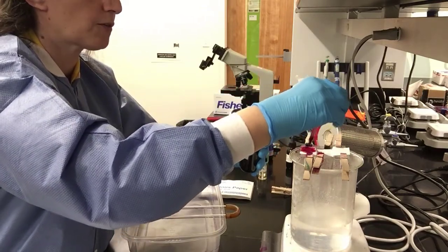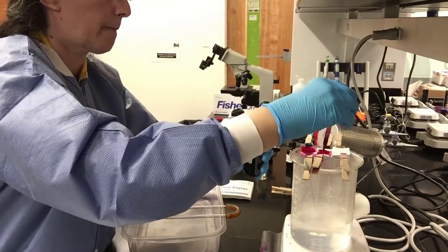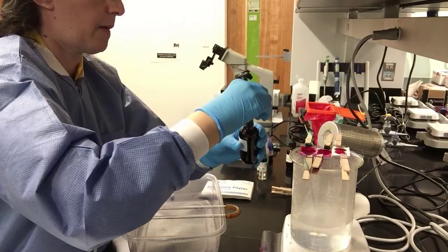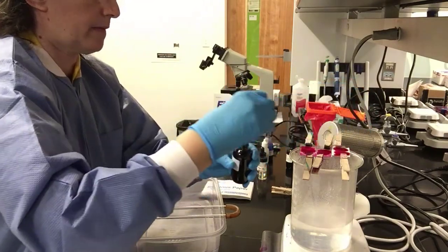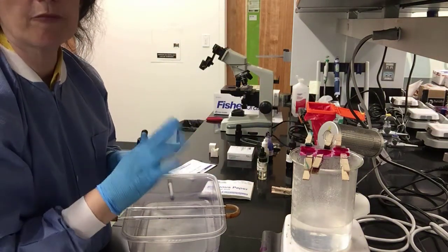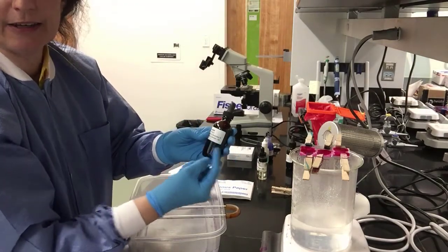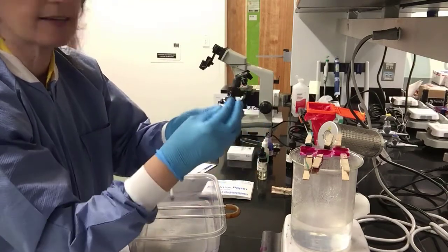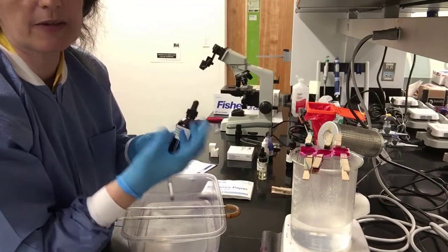So all of these bacteria, especially the ones that are going to be acid-fast positive, are going to absorb the stain nicely. This is a lipid soluble stain. So we want to make sure we really flood the slides with carbolfuchsin, and we watch the slides for 5 minutes and literally keep adding carbolfuchsin so the carbolfuchsin is never evaporated. So nothing ever dries out. So we got to keep adding carbolfuchsin and be watching very carefully the slides for about 5 minutes.